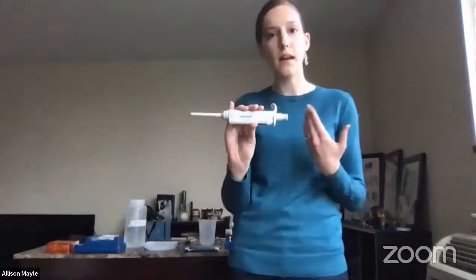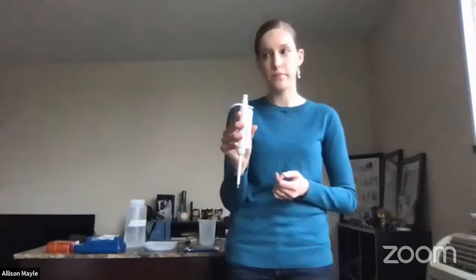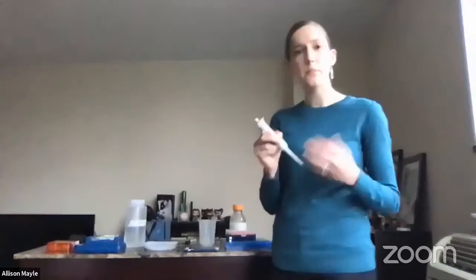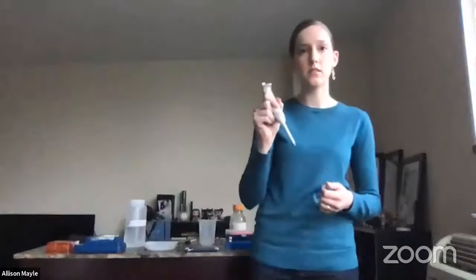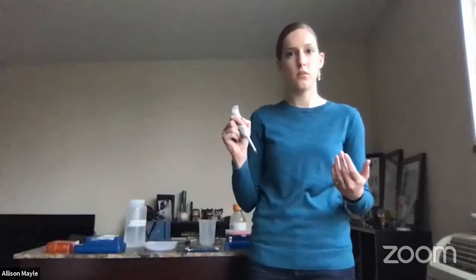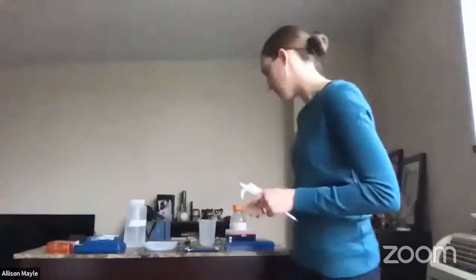And so I think it can be helpful to think about something you're already familiar with when you're using a new tool. All right, so when we use our pipettes, we also don't want to mix up our DNA samples. If I put the end of this pipette into the DNA sample from the evidence, and then I put it into the DNA sample from one of our suspects, what would happen? They would get mixed up, right? They would get contaminated.